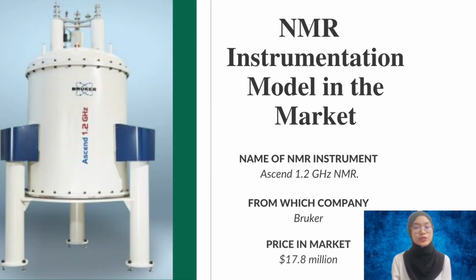Let's move on to the availability of nuclear magnetic resonance in the market. I have found one company that manufactures and distributes NMR, which is Bruker Corporation from Germany.